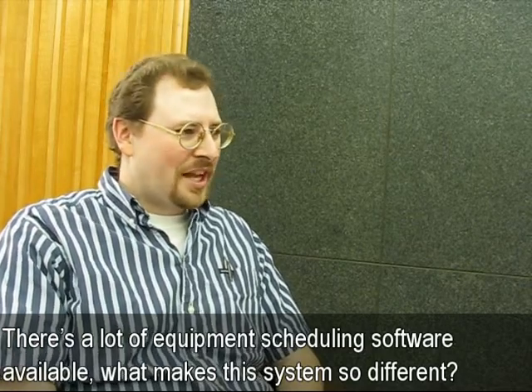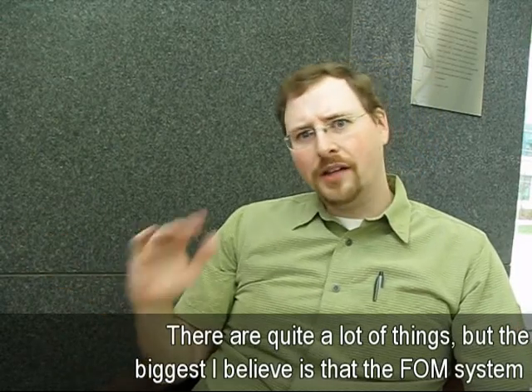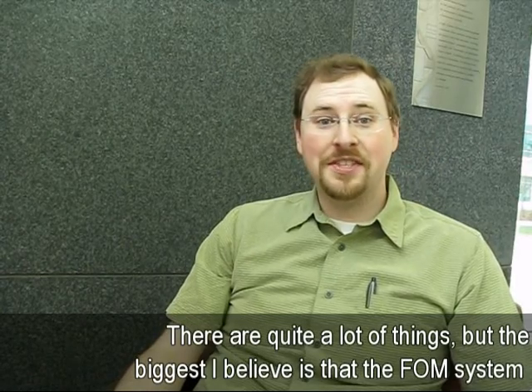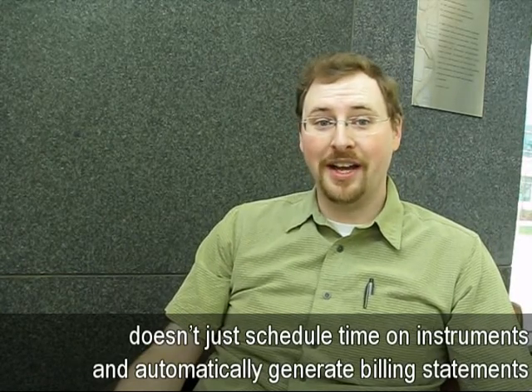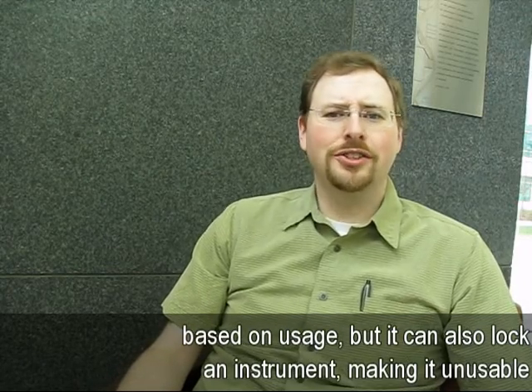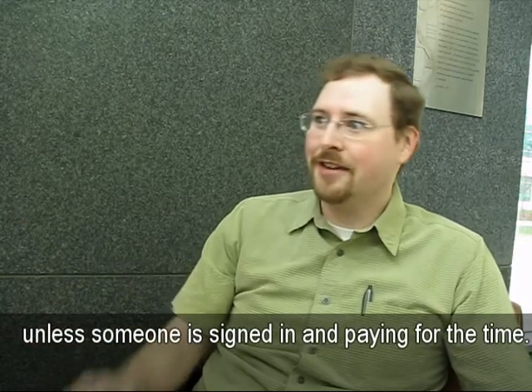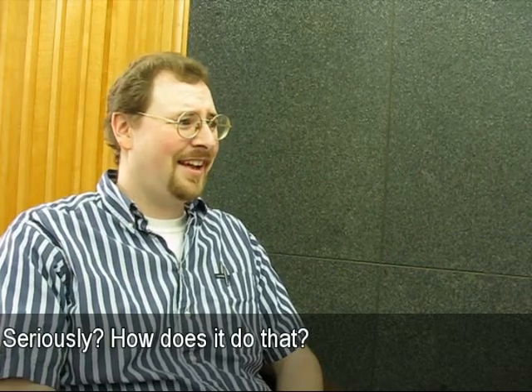Well, there's a lot of equipment scheduling software available. What makes this system so different? Well, there are quite a lot of things, but the biggest, I believe, is that the FOM system doesn't just schedule time on instruments and automatically generate billing statements based on usage, but it can also lock an instrument, making it unusable unless someone is signed in and paying for the time. Seriously? How does it do that?